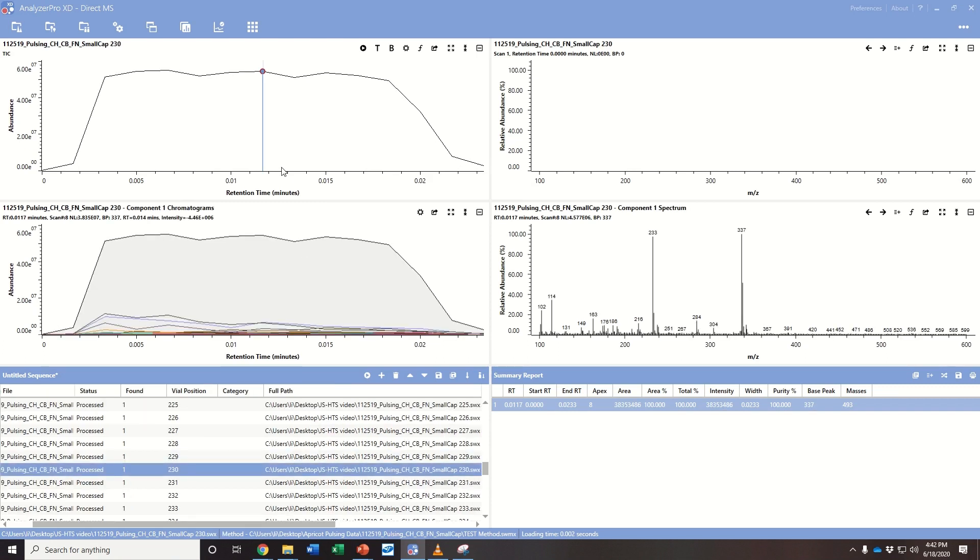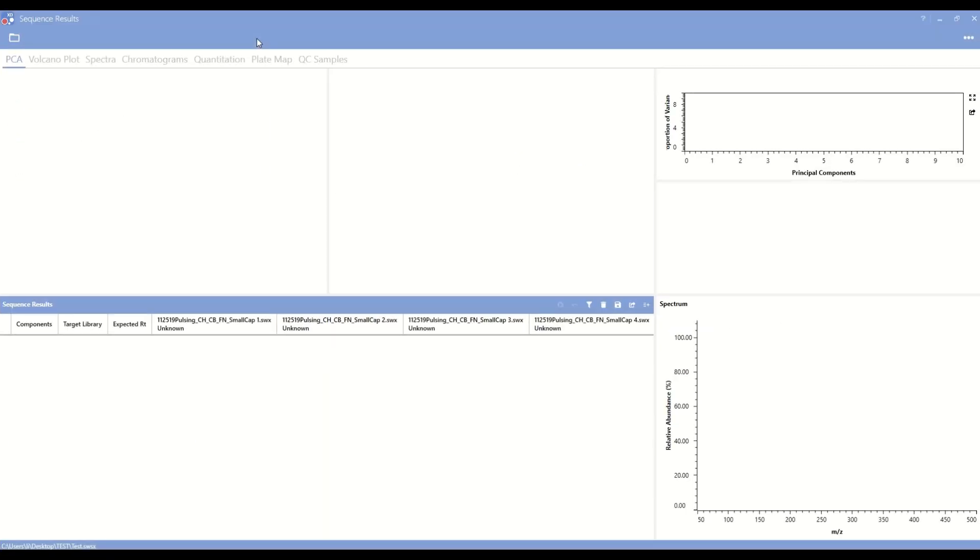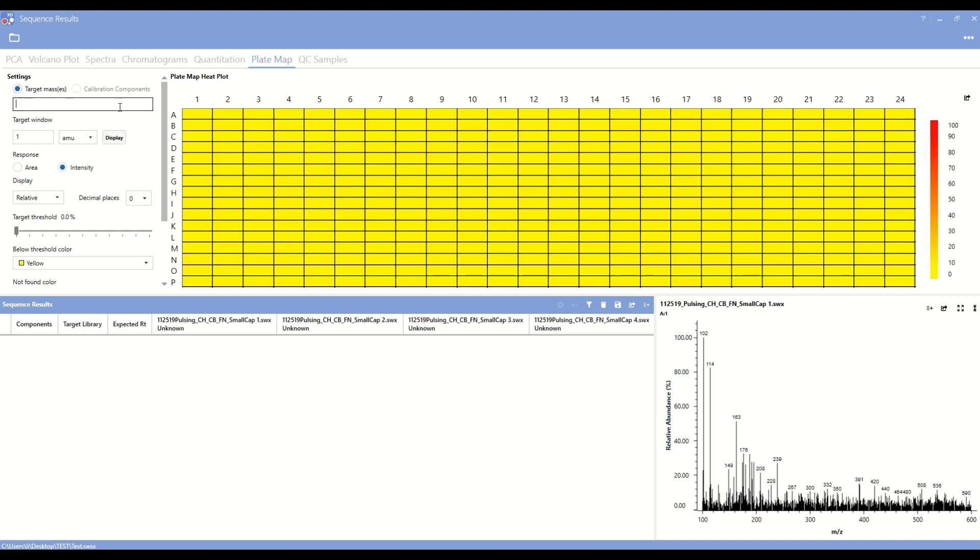You can screen for specific analytes of interest searching by target mass and displaying the results in a well plate heat map format. Wells which show higher abundances of the target of interest can immediately be identified.